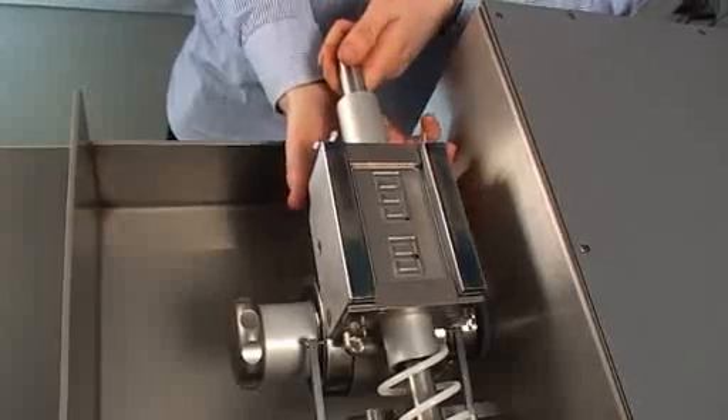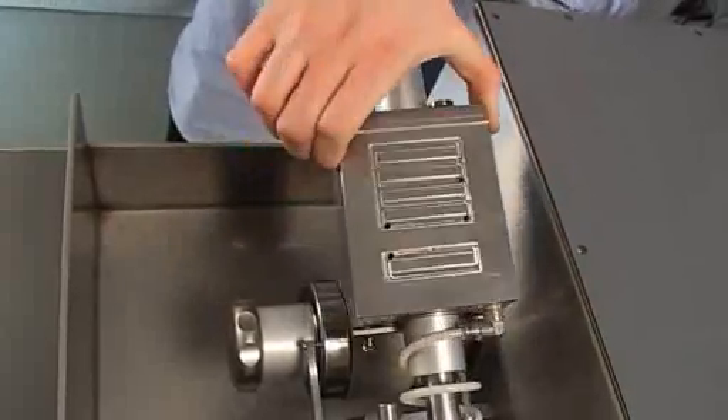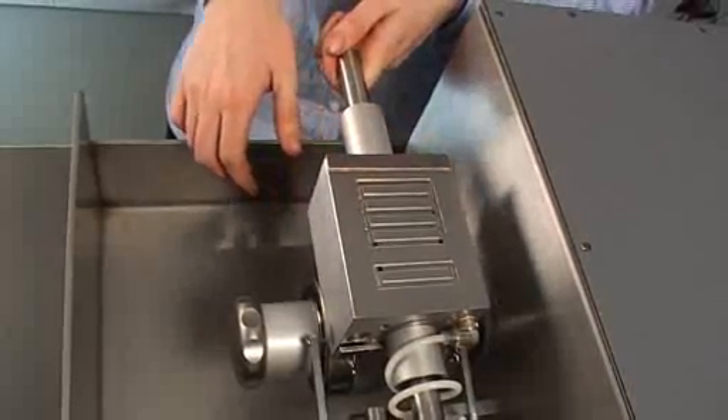The vacuum holder has two sides: one for working on the block and one for holding and grinding the final thin section. From an ergonomical point of view, the two-sided vacuum holder allows you to work in a nice and efficient way, beyond comparison to other systems.